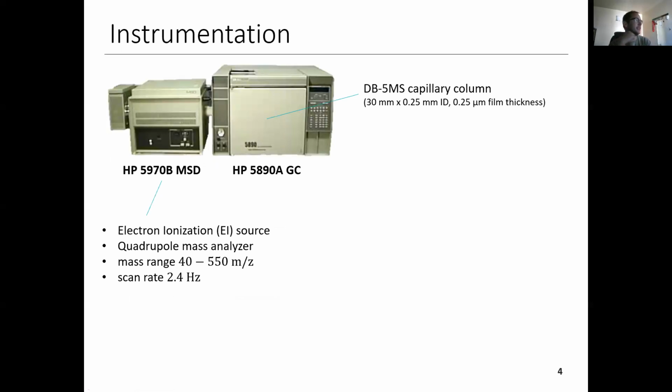So yeah, moving on to the actual content of the lab. This is the instrument that we're working with for the data today. It's unfortunate that we don't get to actually run the experiment ourselves, because it's a nice hands-on experience. Not that anybody is going to be going into GCMS analysis for their jobs or anything, but the process of experiment design, running these things, getting the data, and processing it is a very useful and translatable skill.